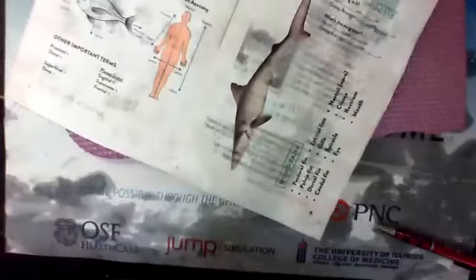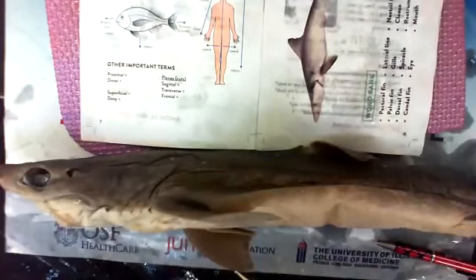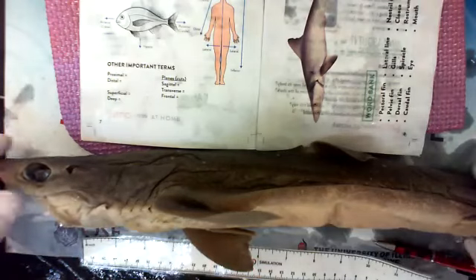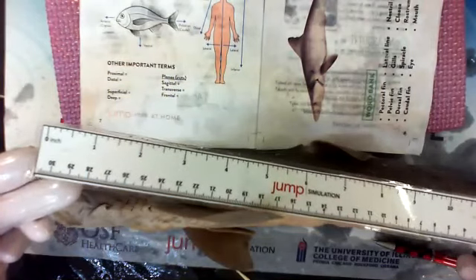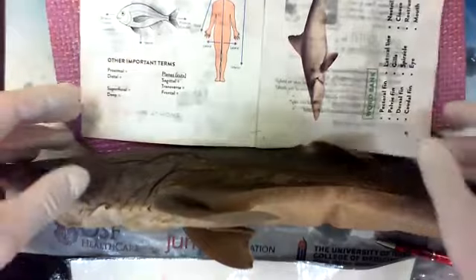Awesome, let's measure this bad guy. So I refer to mine as he because mine's a male. Be courteous or be sensitive if it's a female. She this, she that. Okay, we're going to measure it. So here's our first problem. I've got a 12-inch ruler, almost 31 centimeters long, but I've got a fish that's considerably longer. So how am I going to measure this thing?